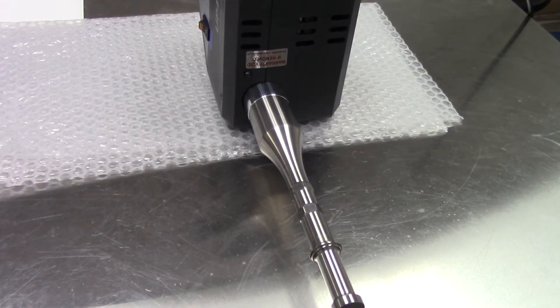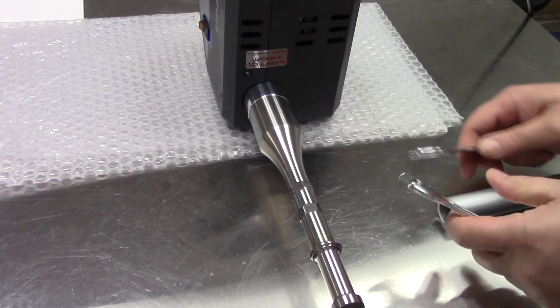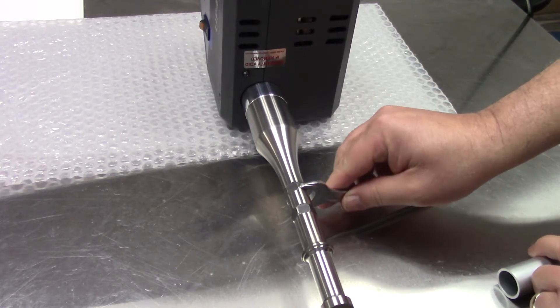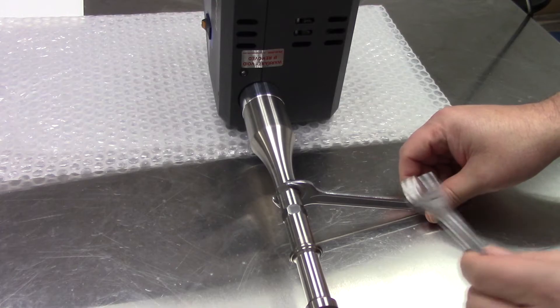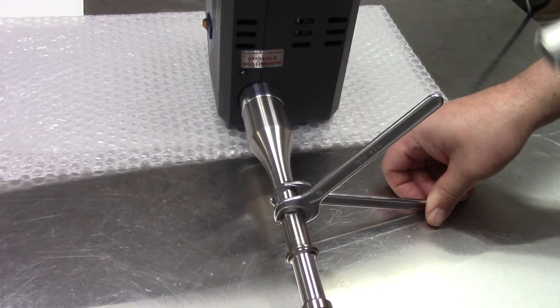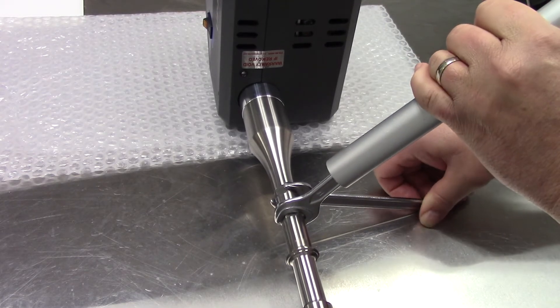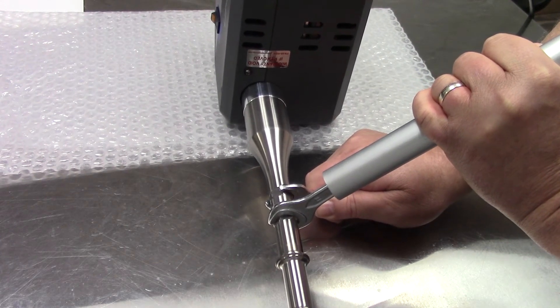Moving to the other side, this time I'll use the pipe or the cheetah bar. I'll once again lock the first wrench in, stabilizing it on the table. Then I'll slip the cheetah bar over the second wrench, using it to apply more force in a downward motion, thus tightening the unit.